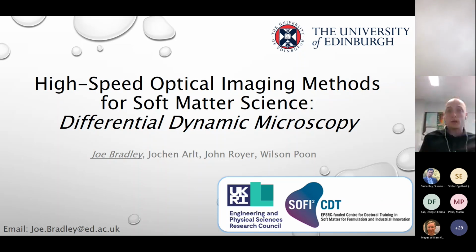Today, Lawrence and I are both going to talk to you about tools which allow some really high quality measurements to be made, but using equipment that is quite general. Our goal is to shift the load from high-end specialist bulky equipment to powerful computational analysis, so you really extract the most information you can. I'm going to start by telling you about a tool called differential dynamic microscopy, or DDM. In this talk, I'll give you a very general overview of the tool and talk about a few specific applications to give you an idea of what it can do. Then I'll finish up with what you actually need to do it and why it is so powerful.